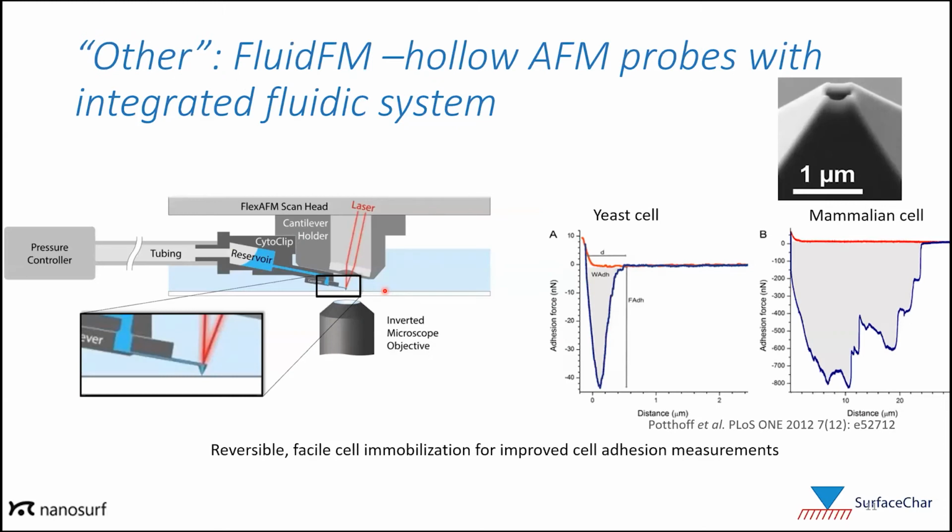Another kind of measurement that I put into the other category is a measurement called FluidFM. FluidFM takes advantage of these hollowed out AFM probes like the one shown here. You can see the opening here is a couple hundred nanometers, and it's integrated with a microfluidic system so that fluid can be pumped, pressurized, pumped through, or sucked out of this hole.